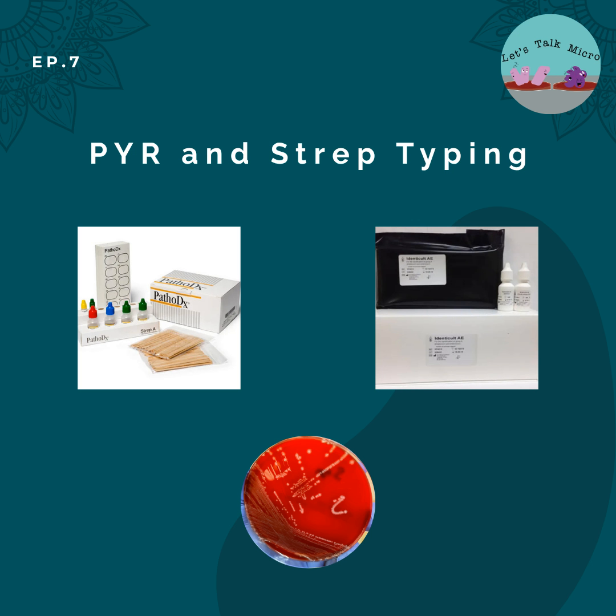Do you? Well, Corynebacterium, it's positive. Listeria is positive. Bacillus is positive. And Lactobacillus, it's negative. So those are four of the most encountered gram-positive rods in the lab. I mean, Listeria to a lesser extent, but definitely Lactobacillus, Corynebacterium, and Bacillus. You definitely work with them a lot.